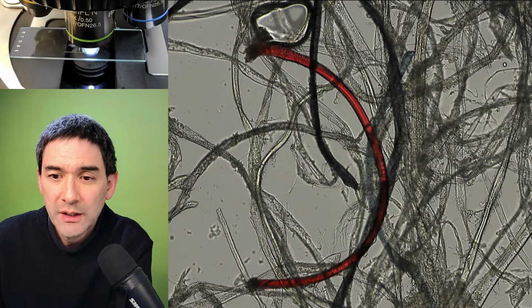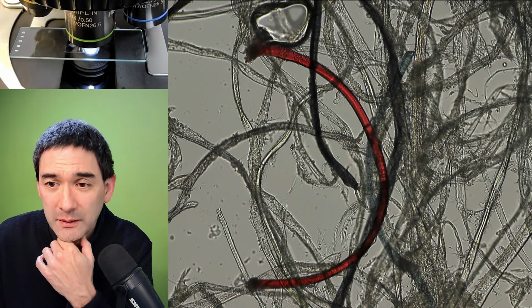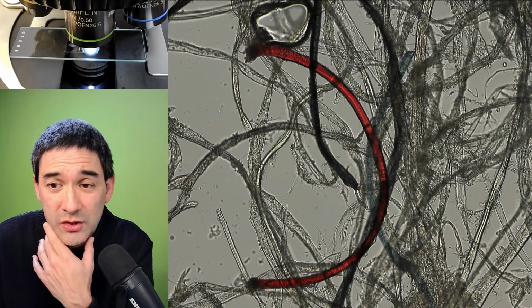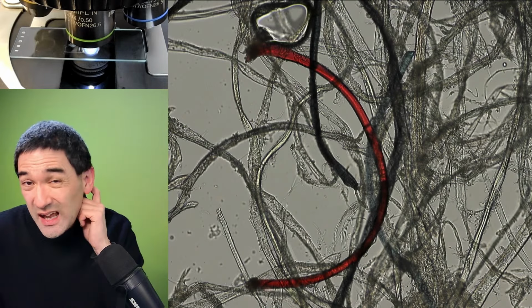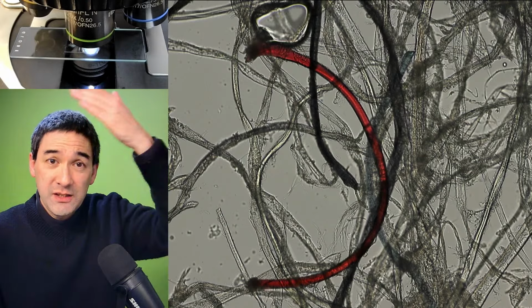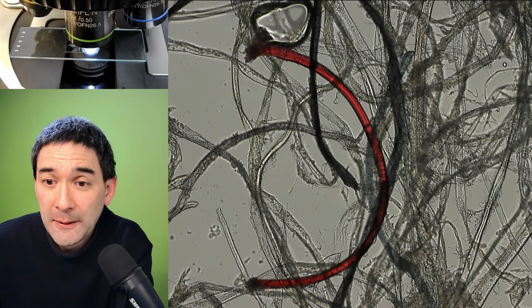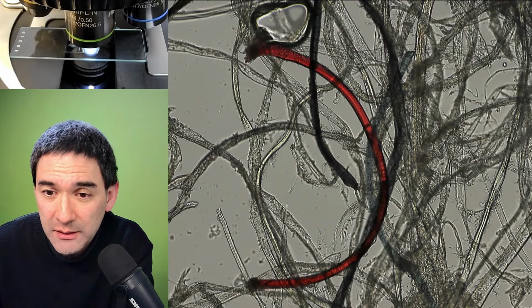So a UV tube lamp is cheap enough, but I know, and actually we have one also in school as well. But the thing that I just want to say is, in that case, I would need some protective gear as well. Some face shield, UV shield, so otherwise I don't want to hurt my eyes. Or there's an eyepiece camera. It's not amazing, but there is one.